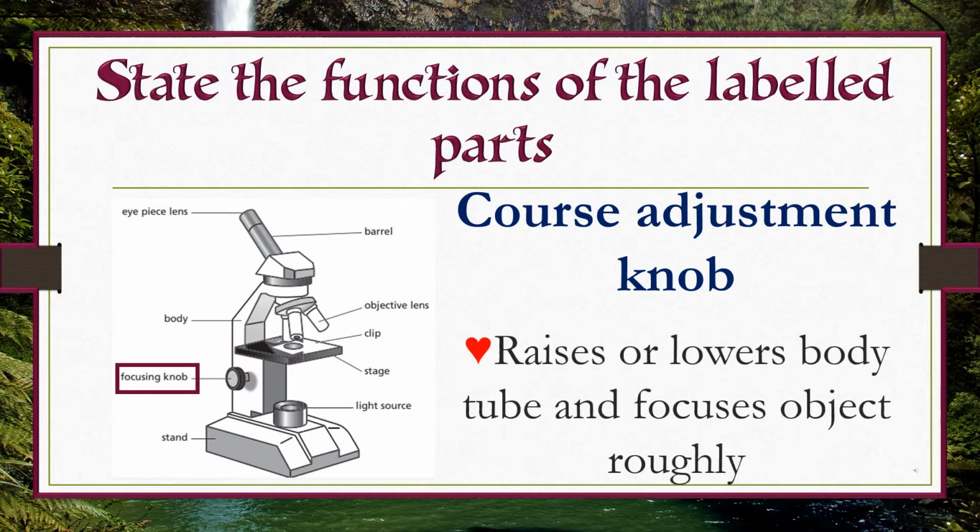It is used to raise or lower the body tube and focuses the object roughly.